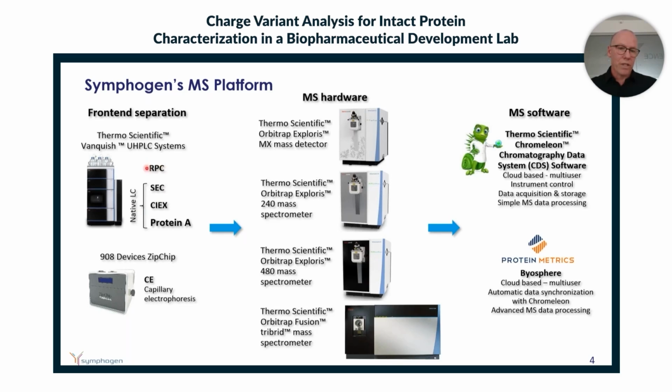Some of them are denaturing, like classical reverse phase, where you have organic solvents and acids, but you can also separate proteins in a native folded conformation using tools shown here. These are routinely used in our lab.